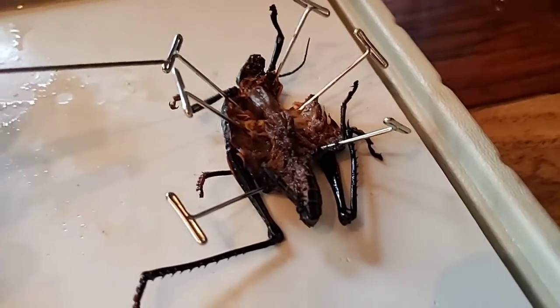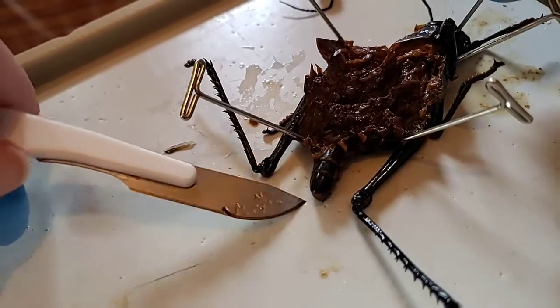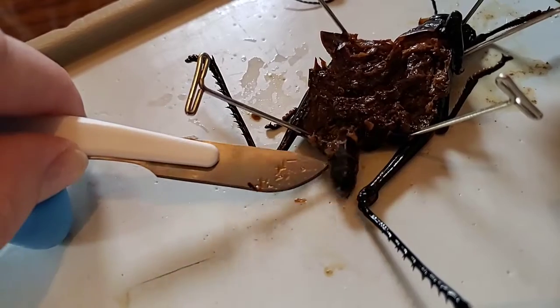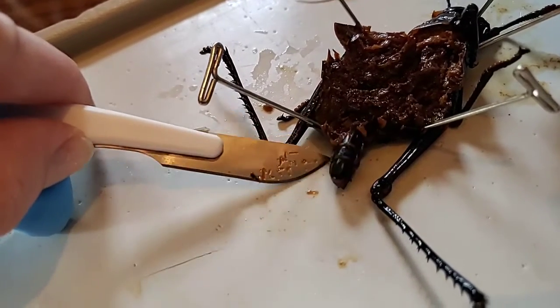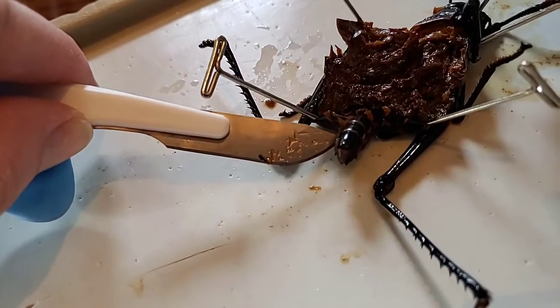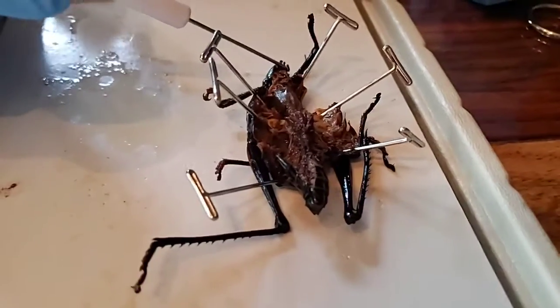Lanston, I'm going to come over to yours. Can you point to your things down here on the end of his abdomen? So right here, buddy. When you look at the side of this, Lanston's is also female. If you lift it up, you can see two right there. One, two, three, four. Those four little points on the bottom. So Lanston's was also a female. Yeah, it smells awful.